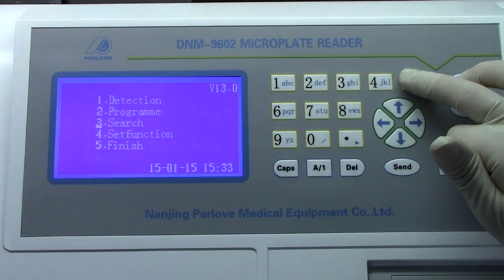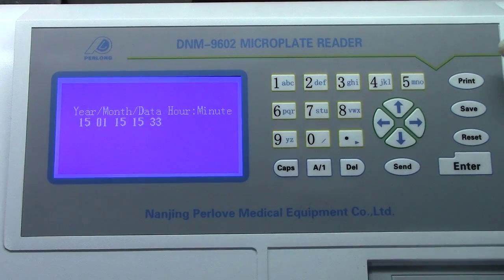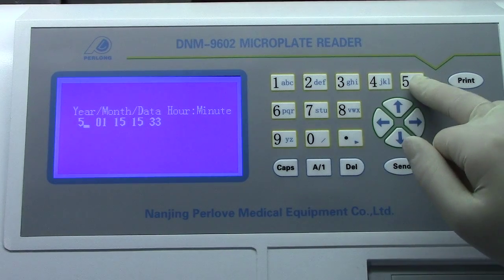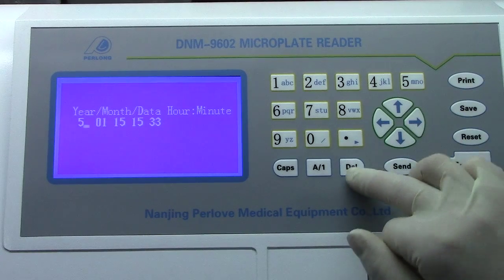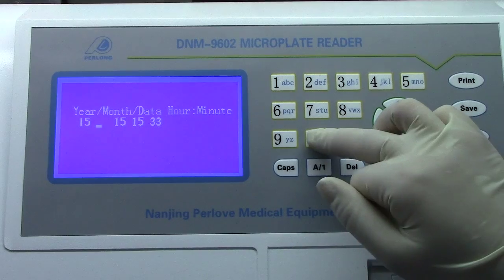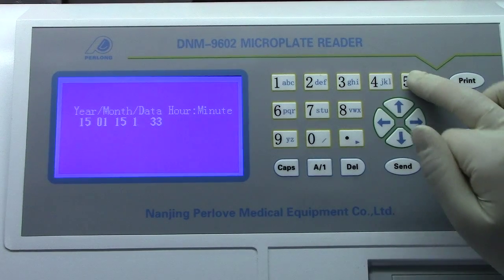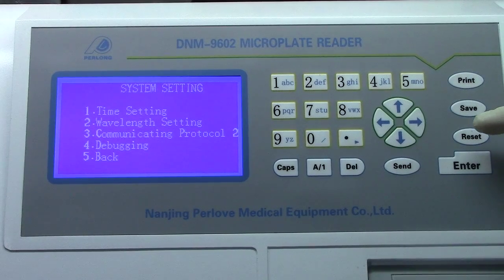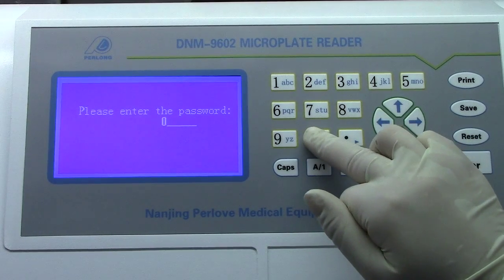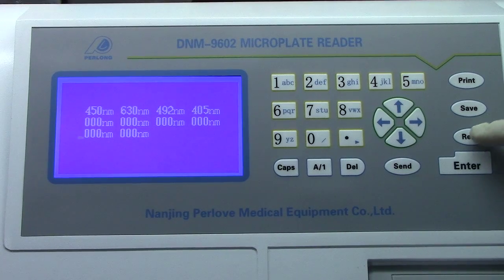Press 5 to return. Now press 4 for set function, then 1 for time setting. This year is 2015, so we press 15. If you press the wrong key, press delete. We press 15 again. Month is January, date is the 15th, time is 15 o'clock, 35 minutes. Function 2 is wavelength — for our engineers only; the password is 60123456. We don't recommend clients to change this by themselves.